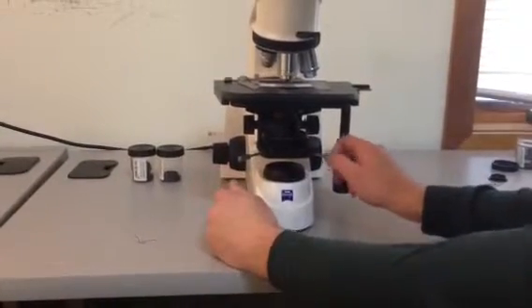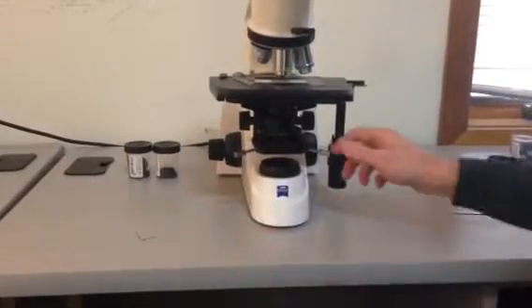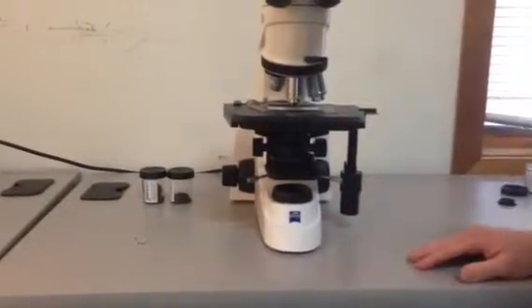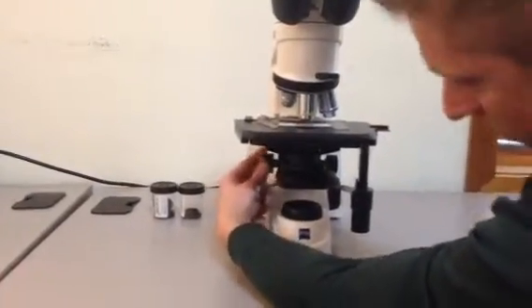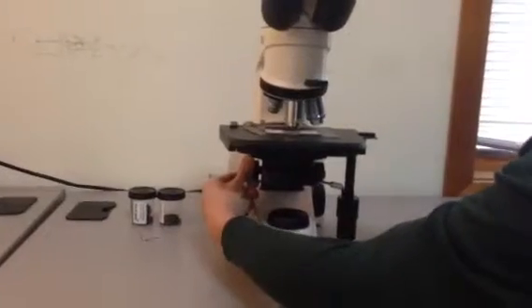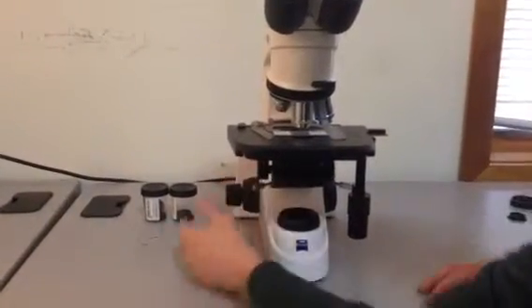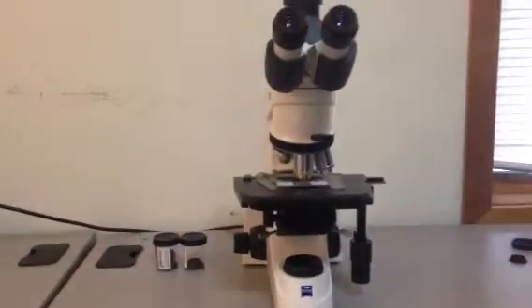Once you feel it catch, take the two screws and give them each about two or three turns, and you'll be ready to align the condenser once we turn the microscope on. Finally, take the condenser and rack it all the way up, let it touch the slide gently, then back it down just a few millimeters. Then you're ready to use the microscope.